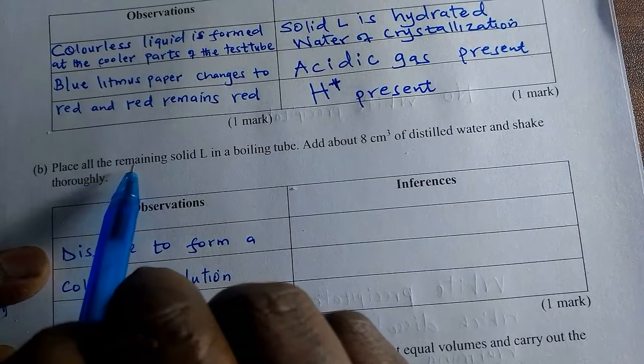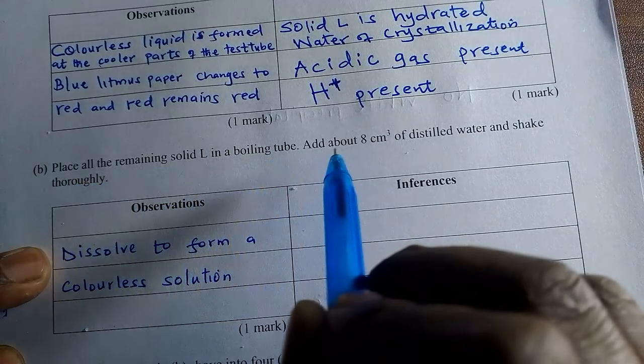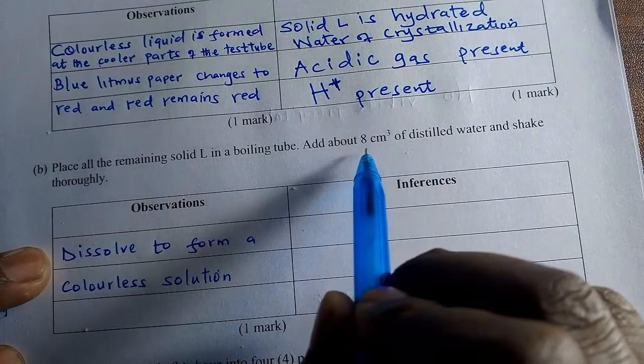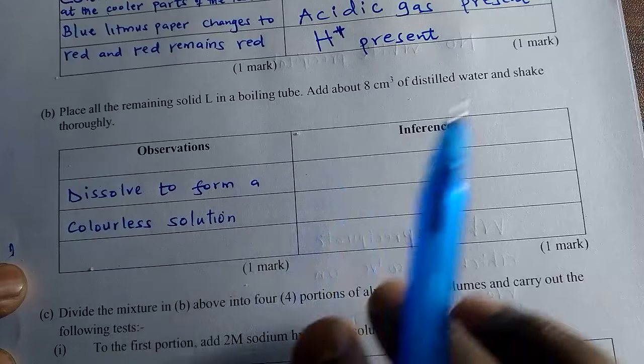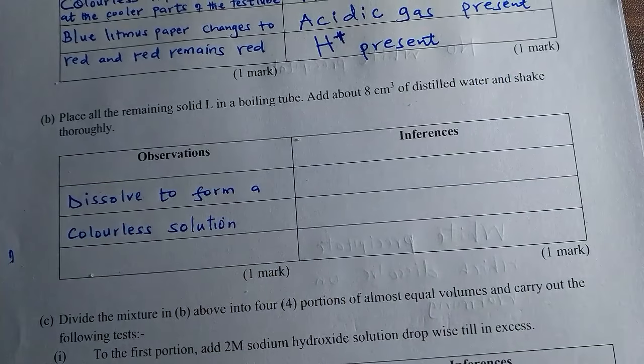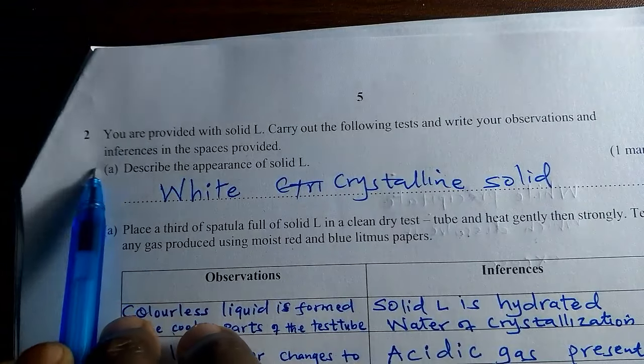Place all solid L in a boiling tube. Add about this much of water and shake. The solid dissolves to form a colorless solution. So we are going to write the inference here. But before that, I want to take you to number 3. This is number 2. Number 3, we will do the same.